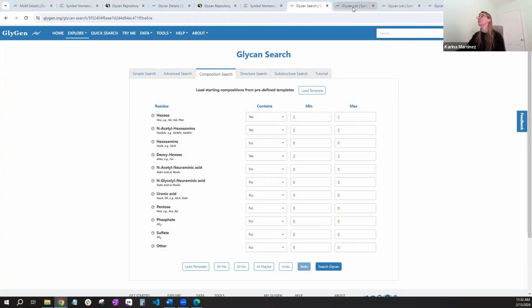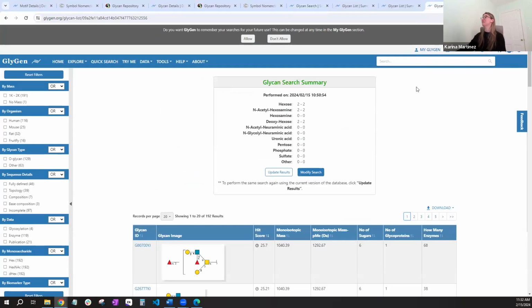Might be going a little bit slow since we're all running it. So I do have my list here from earlier. I'll just use this for now. Okay, so our results, we should have 192 results from that composition search.